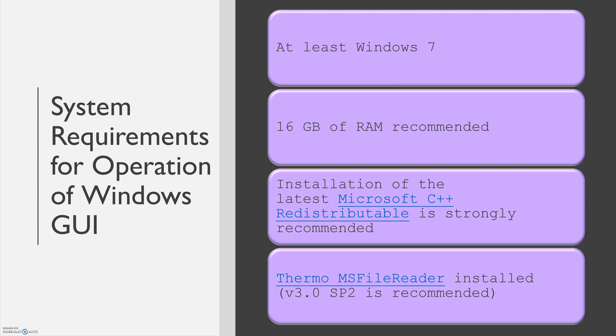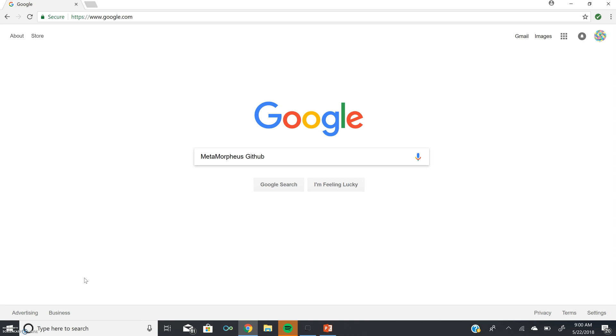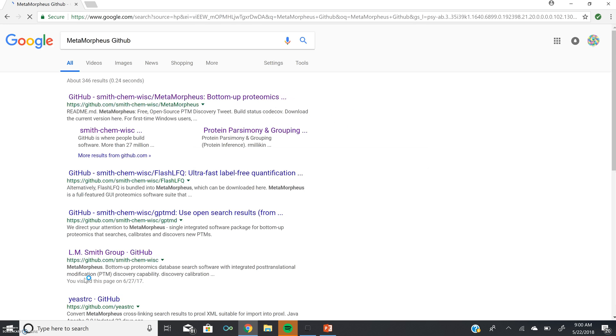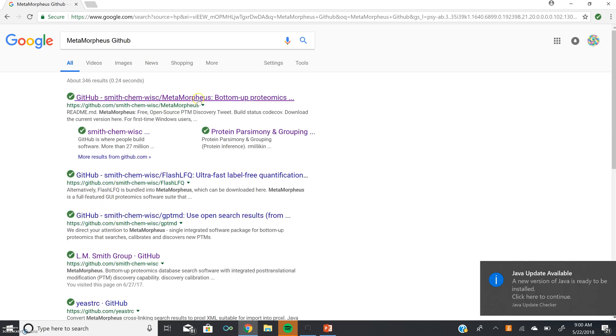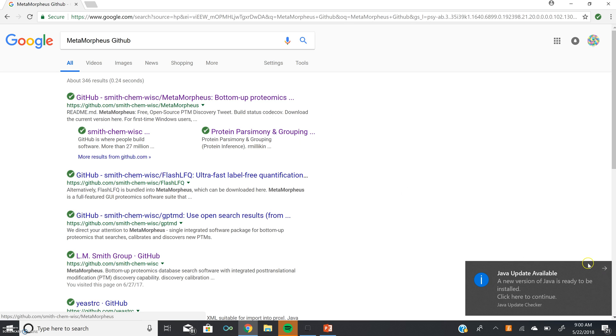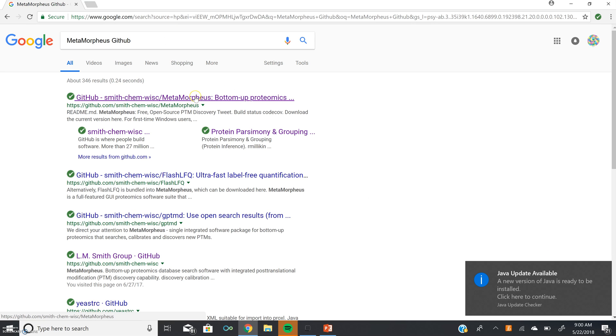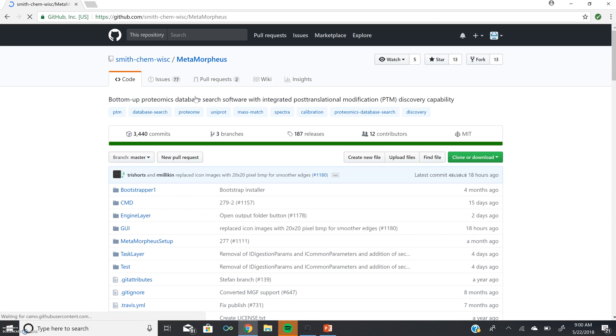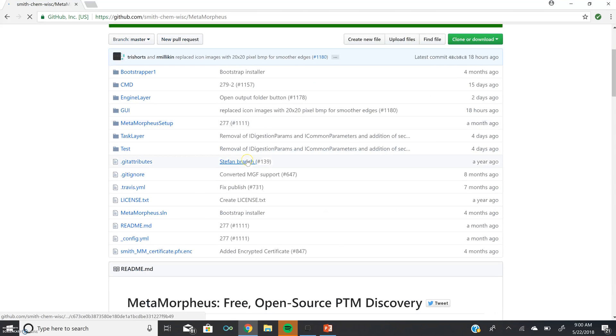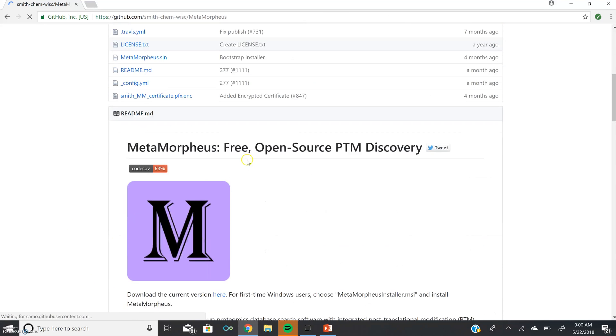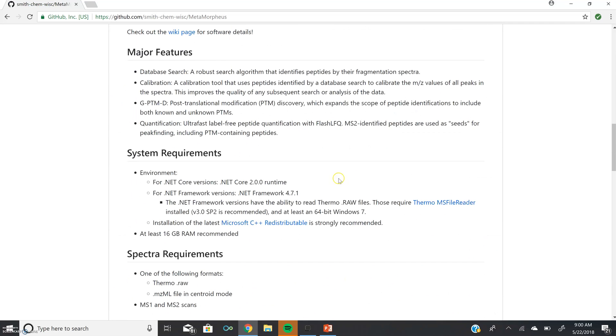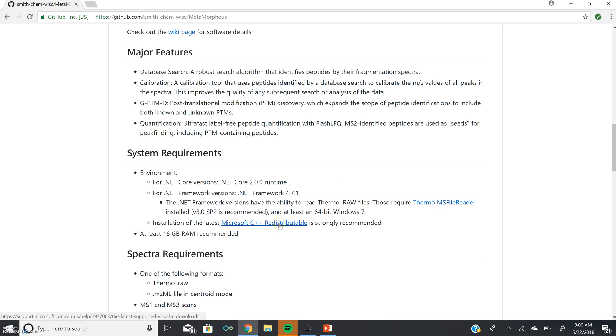On the Metamorpheus GitHub page, there are convenient links to get you to the downloads of both of these. We can get to the GitHub where we host our open-source software program through a simple Google search, and then clicking on the link for github.com/smith-chem-wisc/metamorpheus. We will scroll down to the README and down to System Requirements. Here you'll find the links for the Thermo MS File Reader and Microsoft C++ Redistributable.